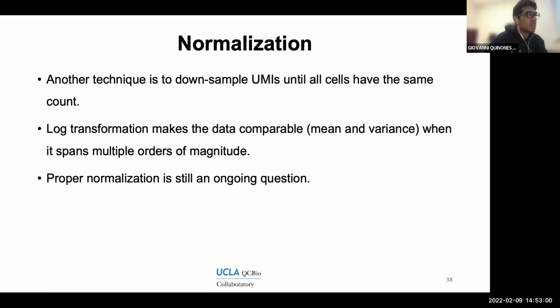And nowadays, there are very sophisticated approaches for normalization, including machine learning. And I would say every now and then there is a new paper presenting their new approach. Like we figured out, we got it. We have this new method that will finally normalize your data for good. I'll just say that it's still a very active area of research involving a lot of bioinformatics and statistics, trying to figure out what's fair, what's the proper way to normalize in order to make fair comparisons.